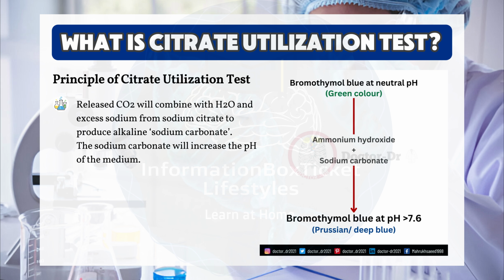Released carbon dioxide will combine with water and excess sodium from sodium citrate to produce alkaline sodium carbonate. The sodium carbonate will increase the pH of the medium. Carbon dioxide plus water plus excess sodium from sodium citrate gives sodium carbonate, alkaline.